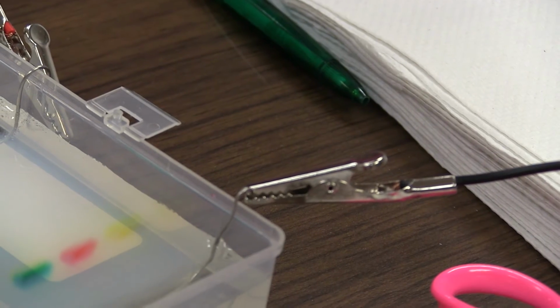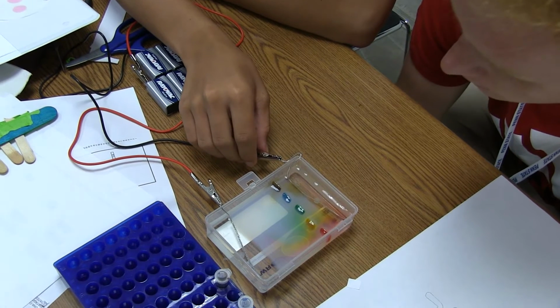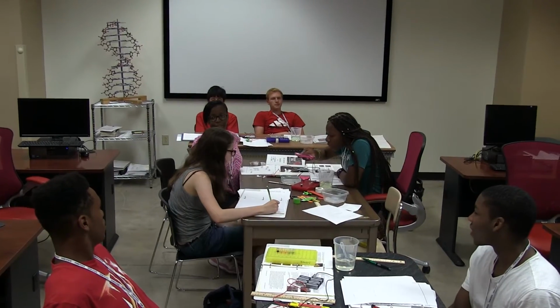Use the electricity to push the colors out separately into the jello, so that you can see the yellow and blue of the green. So like if we had DNA, we can extract the specific parts of the DNA, and we can see if they were the same, if they went out the furthest into the gelatin, or if one was smaller and one was longer than the other.